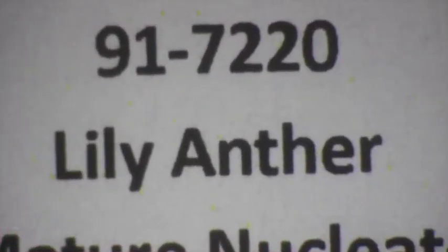Okay, so we'll continue our quest for spores, sporophytes, gametes, gametophytes. Right now we have a sporophyte. The sporophyte then makes a flower. On that flower we have male and female parts, and the anthers are the male parts. Okay, so the anther itself then is diploid, and we'll look over here at the anther. Then, and this is a cross section through an anther. The anther is diploid. We'll zoom in here on this anther.